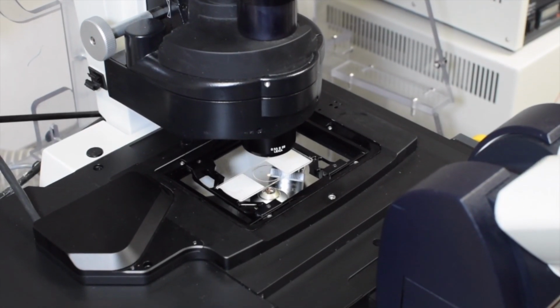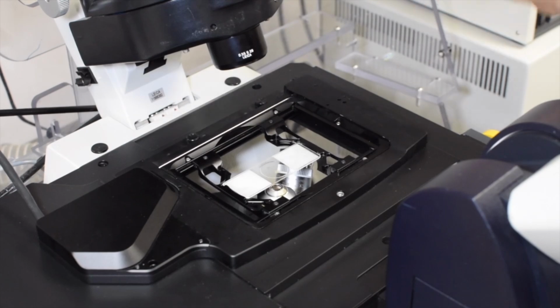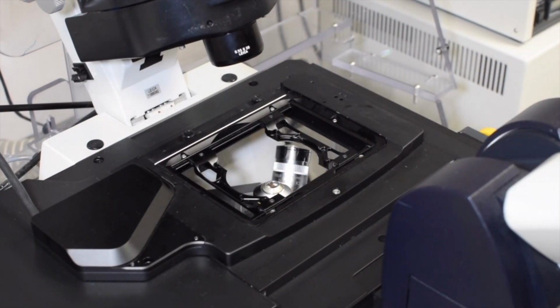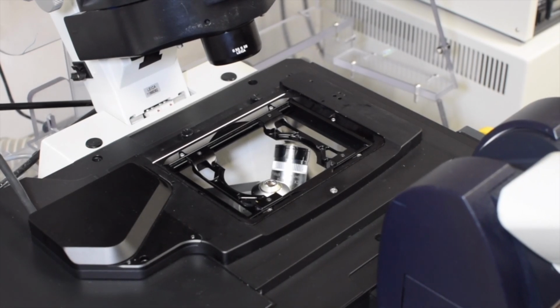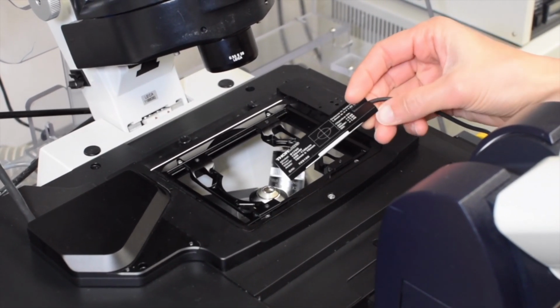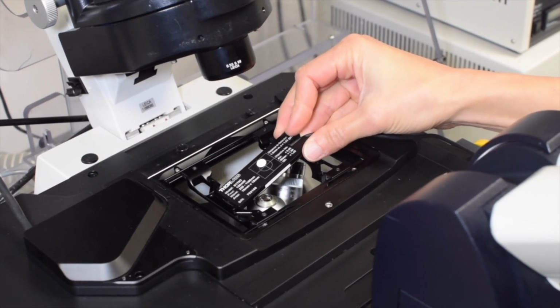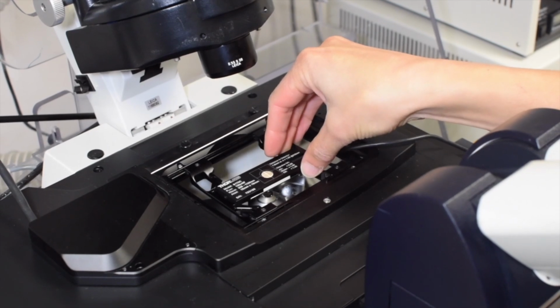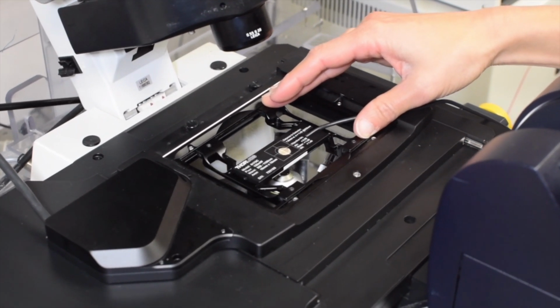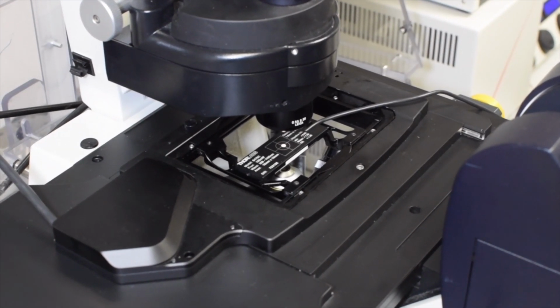We propose to perform the measurements with the 10x objective in position. Ensure it is clean and presents no sign of damage, 1 hour after turning on the system. It is therefore necessary to focus on a sample before positioning the sensor on the sample holder in order to obtain a reproducible measurement. Once the probe is positioned, you can center it with the transmitted light illumination spot. This will assure a good centering of the sensor with the objective lens.